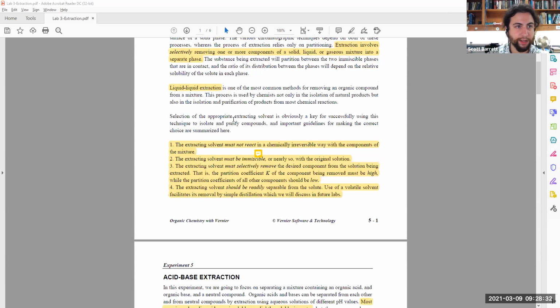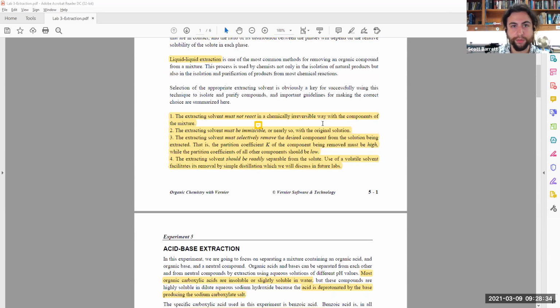This can also be used in biochem labs with other techniques as well, using ion exchange in order to separate that. But I'm not going to go too deep into detail there, just so that we can understand what's happening here.